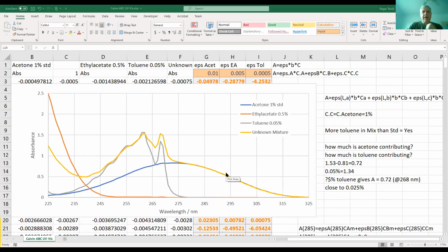Now, Gavin. No, Alexis. At what wavelength ranges are epsilon B and epsilon C 0? It's like from 280 and up. 280 and above. Perfect. Okay, so now, this is useless for determining the concentration of component B, right?